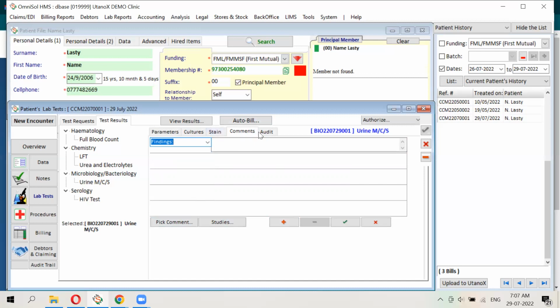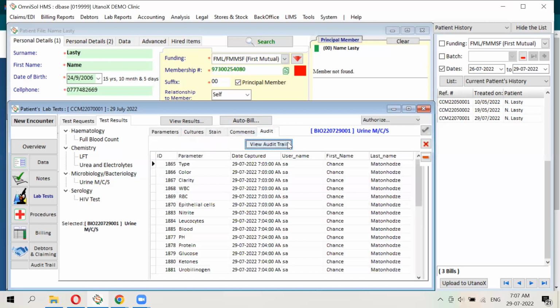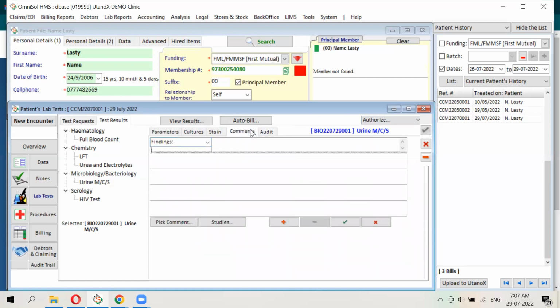And it also keeps an audit trail of who are the users who made different changes. In this case, it's just myself. So I'm the one that entered every one of the parameters. If they were different, then yeah, if they were, list everybody. Exactly. Everyone is according to who is logged in, right? That's correct. Okay. That's correct. And of course, we do not want users sharing access credentials, because that defeats the whole idea of logging in in the first place. Yeah. Right.